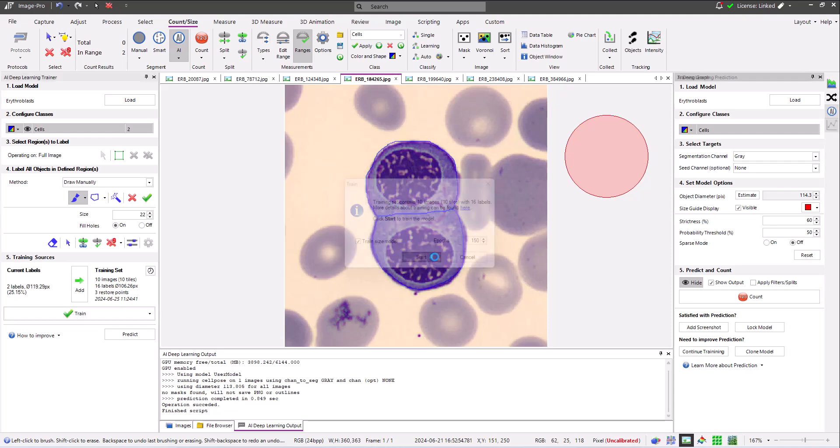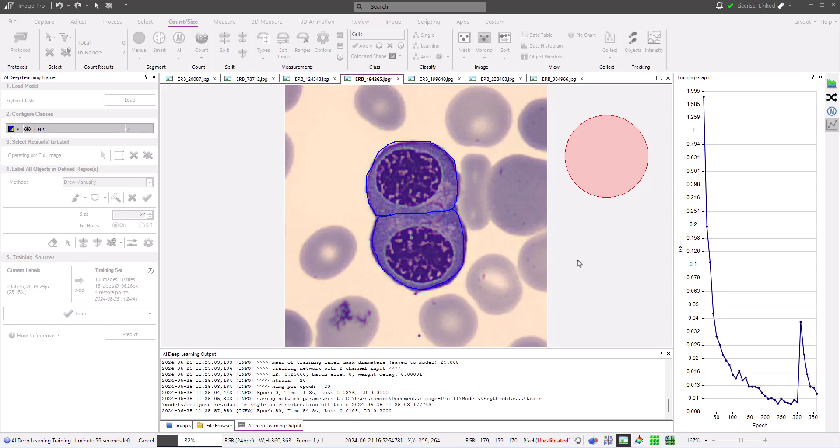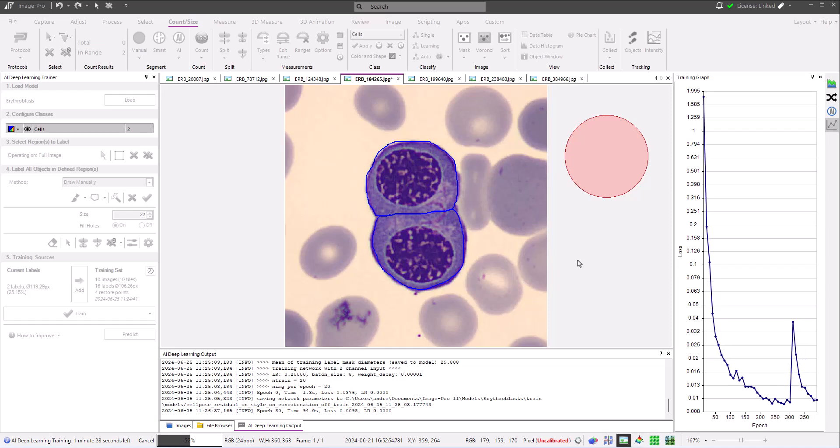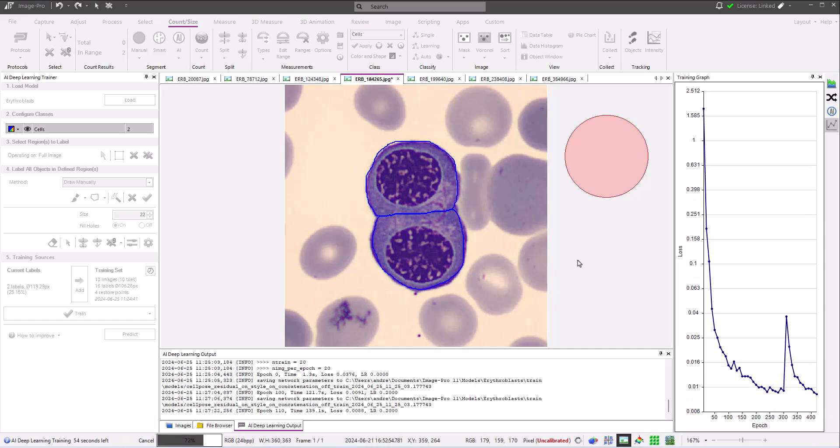After adding additional training data, a second round of training is done, this time of 150 epochs and again shown speeded up. Note that the loss increases after new training data is added, but quickly decreases as the training progresses.